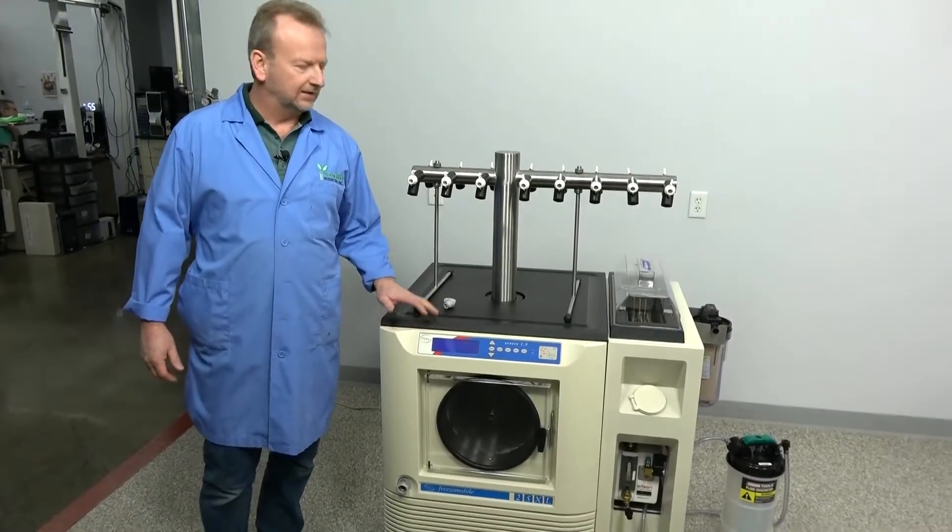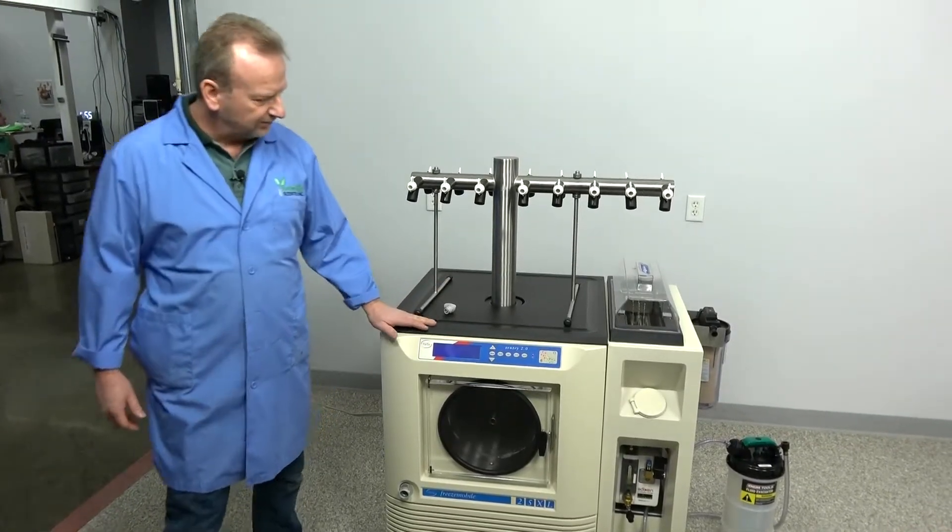Hi, I'm Rich at New Life Scientific, and today I want to show off the Virtus freeze mobile that we just got in.